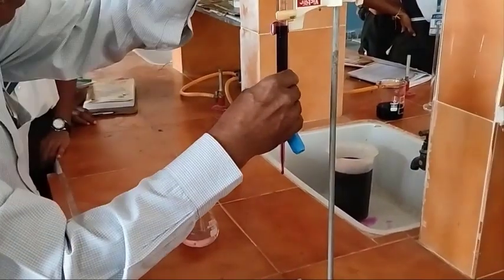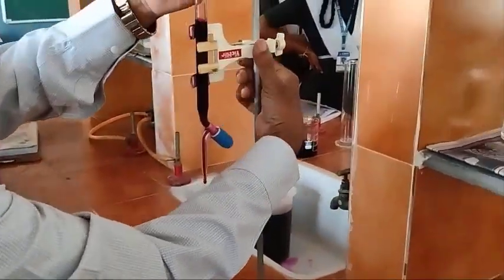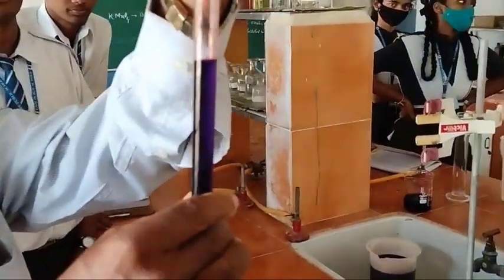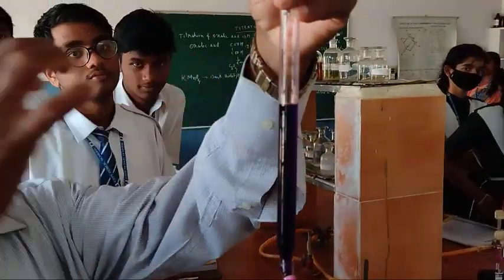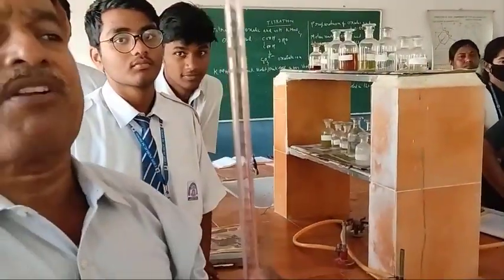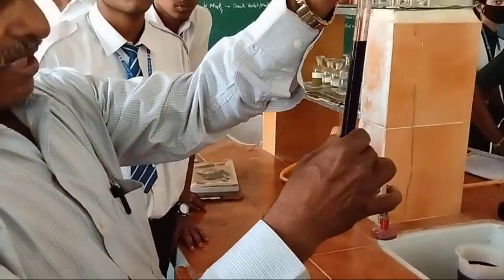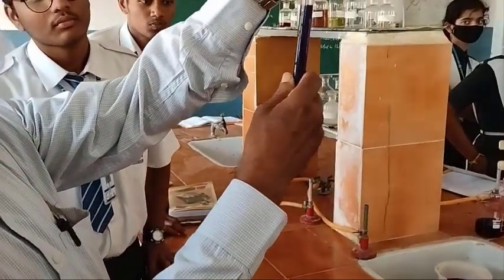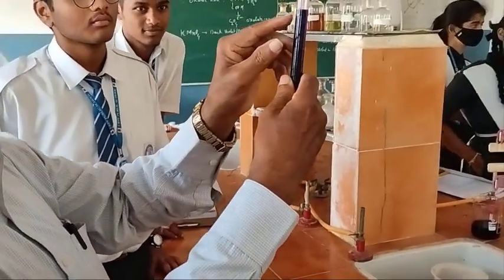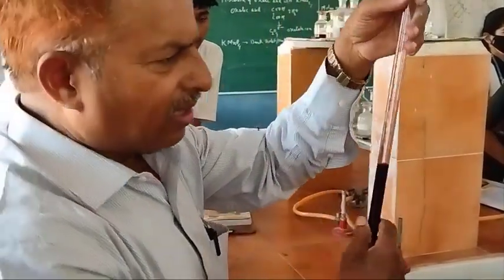Once the reaction is completed, you see the burette reading. When you are seeing the burette reading, keep the burette parallel to the eye. If you see like this or like this, what happens? There will be parallax error and 0.2 ml may be different. Now what is this reading? The reading is 41.8.